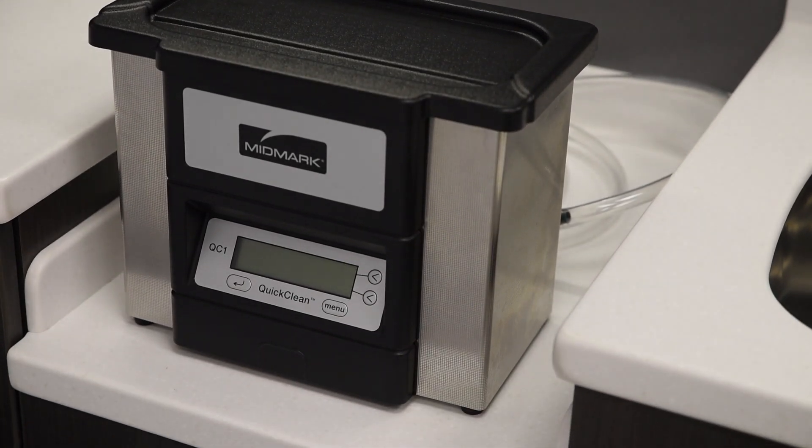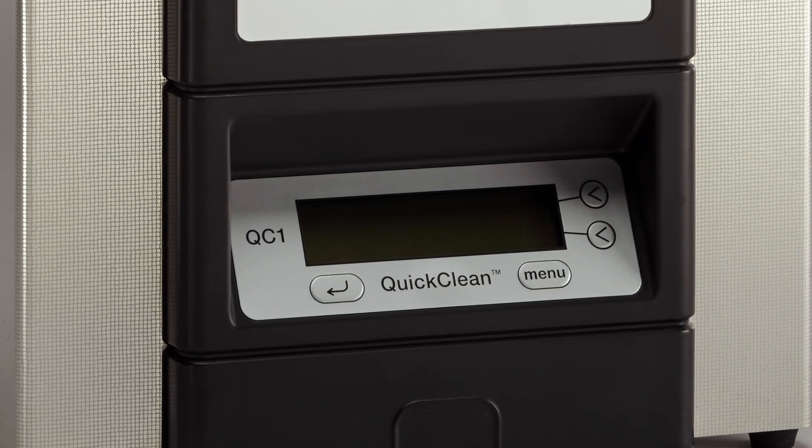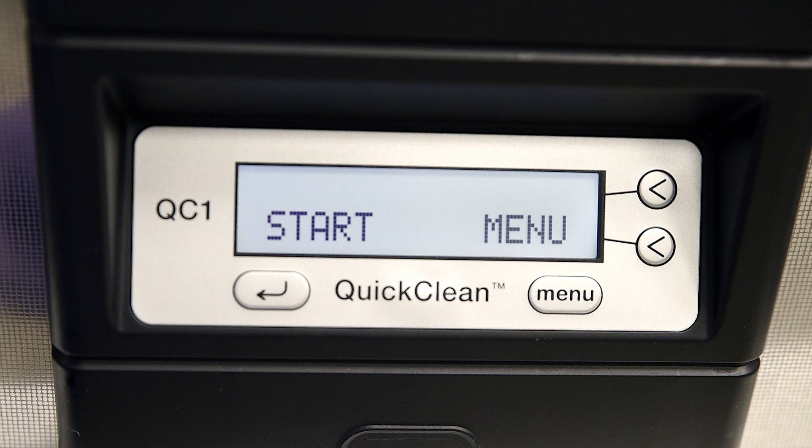Your QuickClean is operated through a menu-driven control system. I'll review the controls on the user interface now. Key 1, or the left arrow key, is the start/stop function on the unit. Key 2 is the menu button and will scroll through the different menu options.